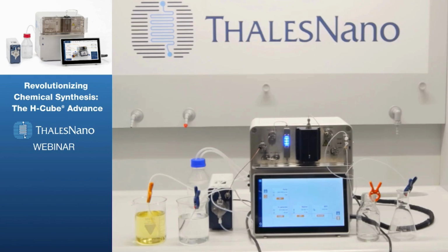I'm just going to allow this system another 5 or 10 minutes for the new solvent to reach the end of the flow path, and that will signify that the washing has been completed. This is also useful for reactivating the catalyst at the end of the experiment, so you don't have to just do it before the experiment. It's also an option and a good practice to do it after the experiment. So it's very good for the longevity of the catalyst.